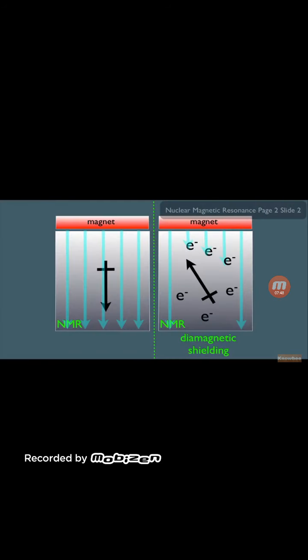From the applied magnetic field, which means this hydrogen atom on the right here is most likely not going to change his orientation. He'll stay exactly how he is. However, what if we do something like this? Let's say we hook up some kind of light source, and this light source has the ability to produce RF radiation, or radio frequency radiation.